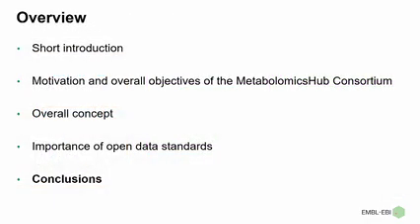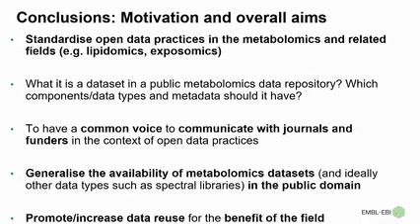So just the final slide to highlight again the main objectives of the consortium: to standardize open data practice in metabolomics and related fields, including lipidomics and exposomics, for instance. We need to really standardize what is a data set in a public data resource.